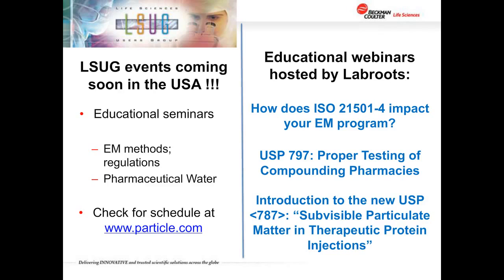It's a matter of what's been needed in terms of clean room. But if you're talking about the air in the clean room and the particles in the air, the concentration of it, this can be used for that. And it's not a matter of it being sterile or not sterile. It's a matter really of, do I want to control the level of airborne particles?